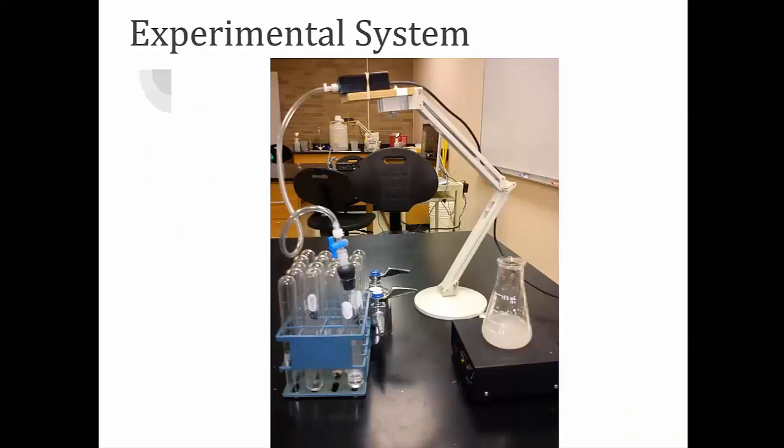This is what the setup will look like. We are going to use a pressure probe attached to a cork. We are going to mix our peroxide and use yeast. Yeast is a good model organism in this experiment because yeast is just like you in that it has a nucleus and all the major organelles. It is a eukaryote and it has catalase just like your cells do.